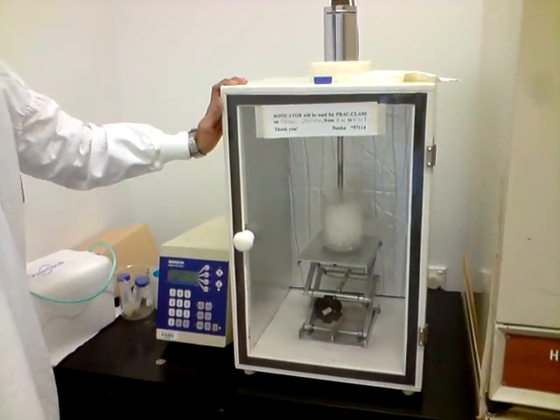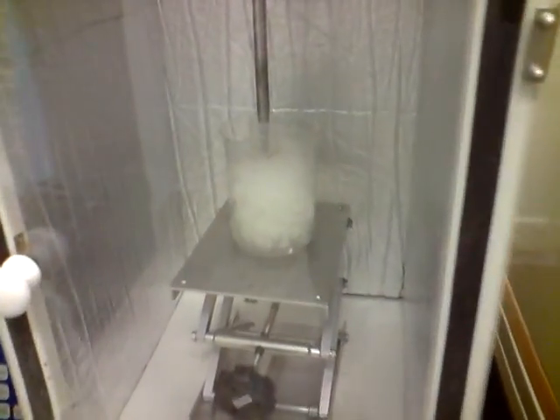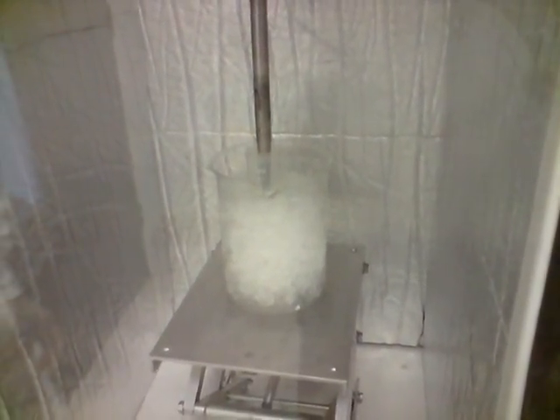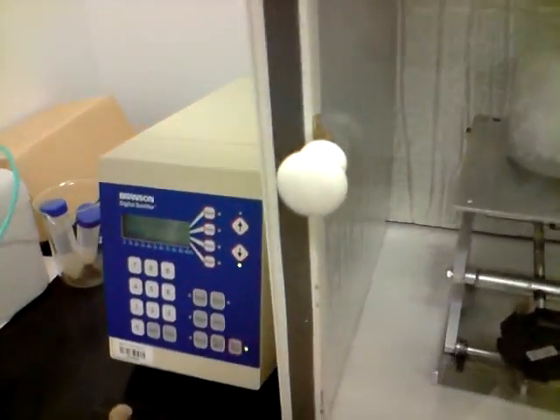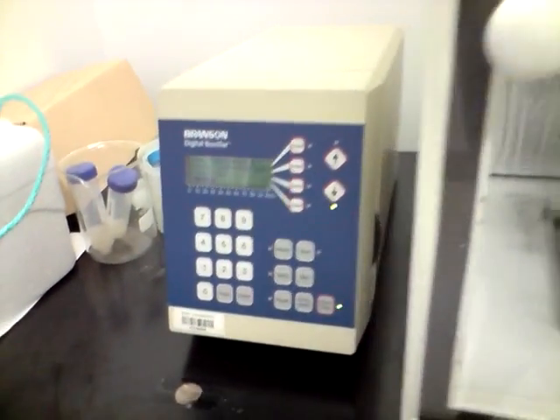Now the sonicator has started. We really can't see the solution inside, but it must be probably frothing up — that's what happens when the sonicator starts and the heat temperature goes on. With the ice, the temperature should hopefully remain quite low and not damage the bacterial protein.